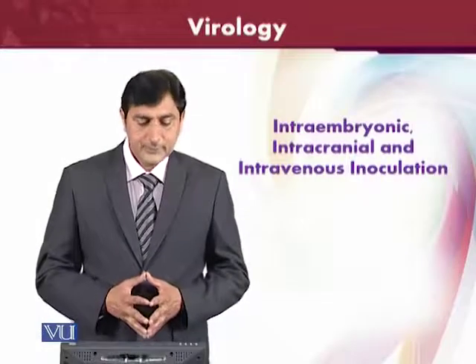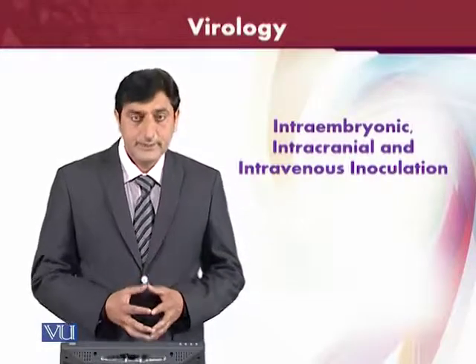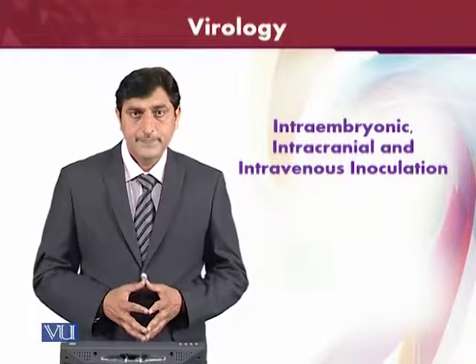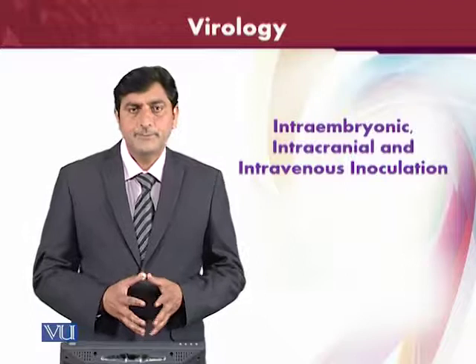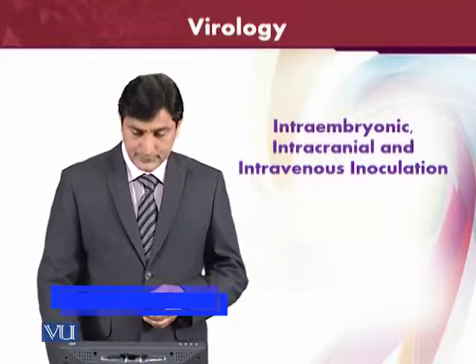Next is intraembryonic, intracranial, and intravenous inoculation. These are very rarely used inoculations. However, sometimes we have to use these inoculations.